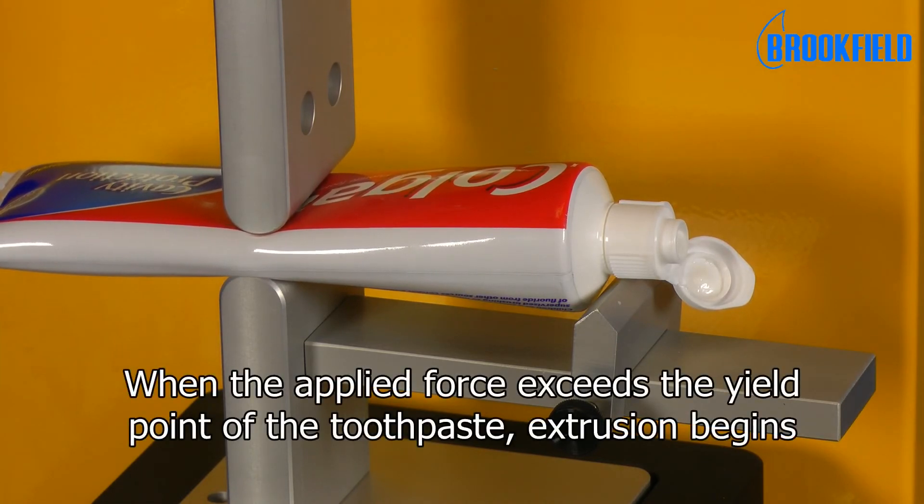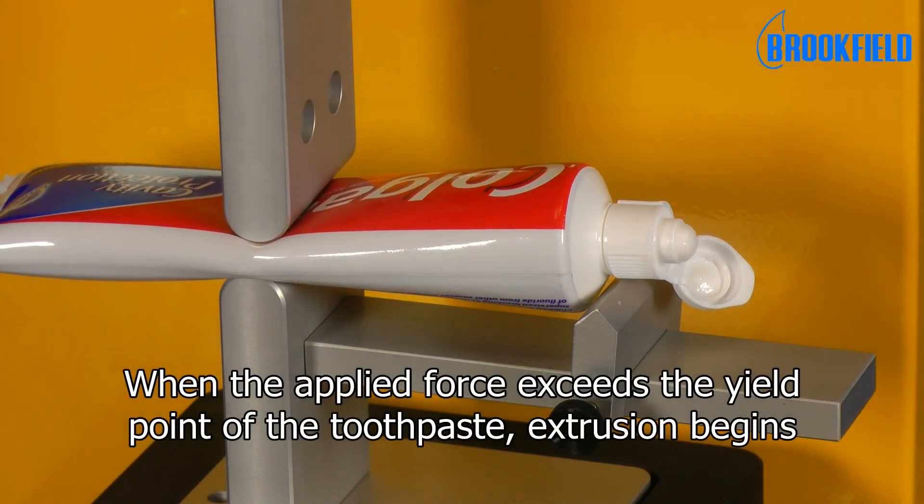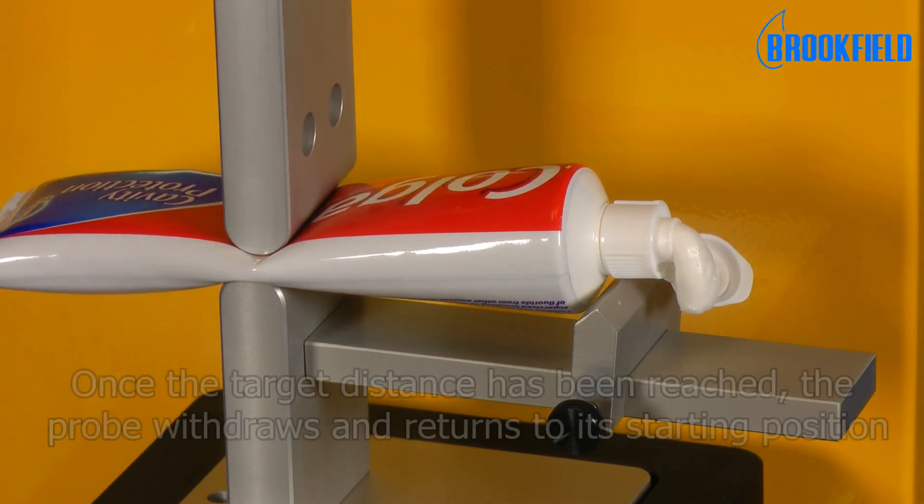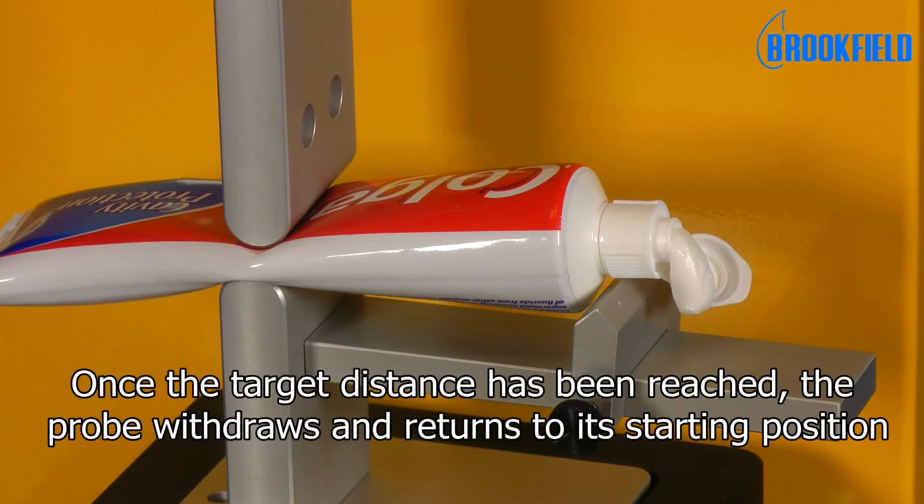When the applied force exceeds the yield point of the toothpaste, extrusion begins. Once the target distance has been reached, the probe withdraws and returns to its starting position.